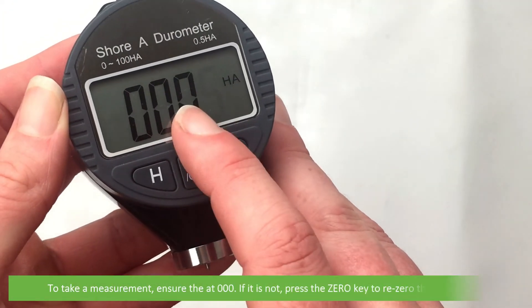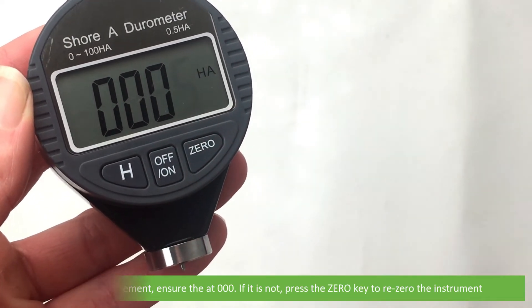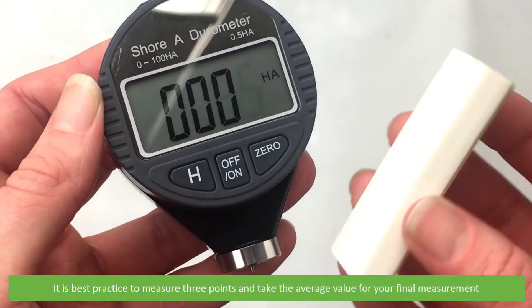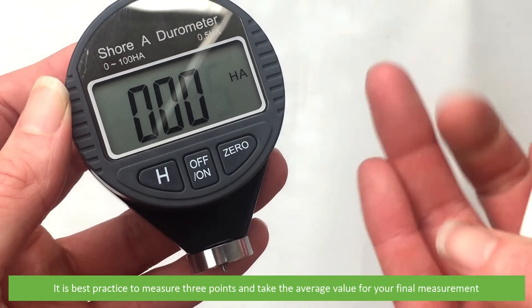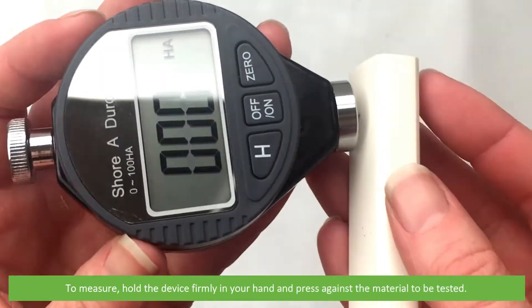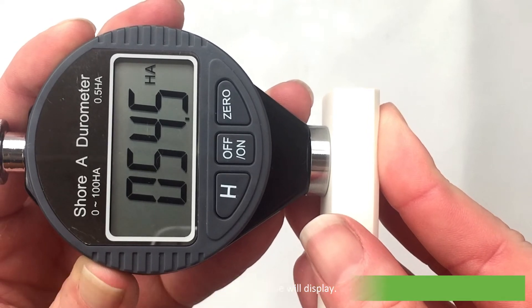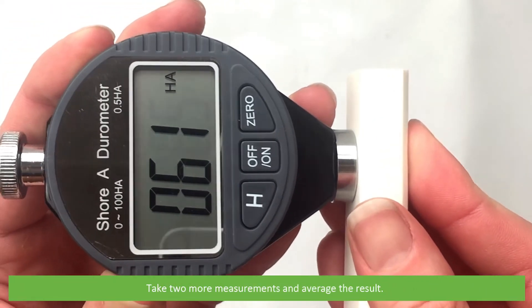To take a measurement, ensure the display is at zero. If it is not, press the zero key to re-zero the instrument. It is best practice to measure three points and take the average value for your final measurement. Hold the device firmly in your hand and press against the material to be tested. The measured value will display. Take two more measurements and average the result.